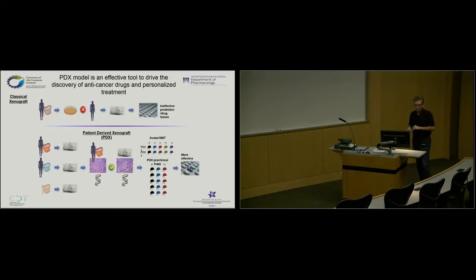As we've already alluded to, with patient-derived xenografts, we take fragments of tumors and put them into mice, and then you take that tumor out of a mouse, you grow it up to maybe a gram, and you cut it into 2 by 2 millimeter fragments, and then you reimplant them into the next generation to expand, and you keep expanding until you actually get to the point where you have enough mice populated to be able to do a study, for example, to test a new drug. And there's a lot more heterogeneity in that.